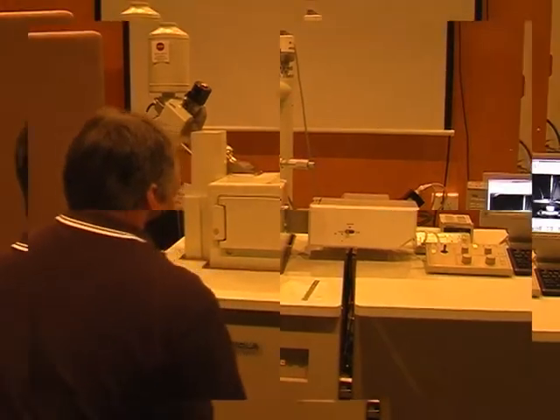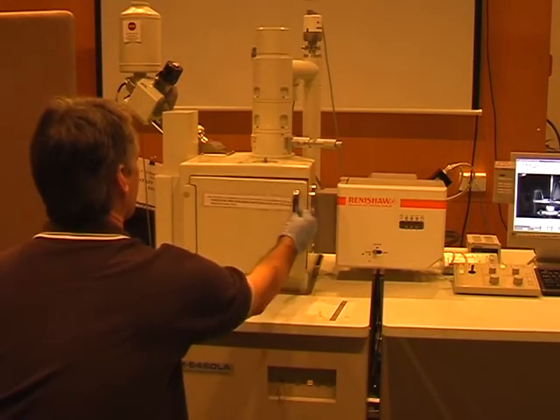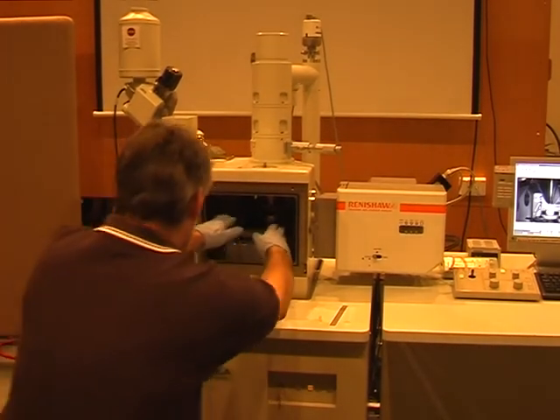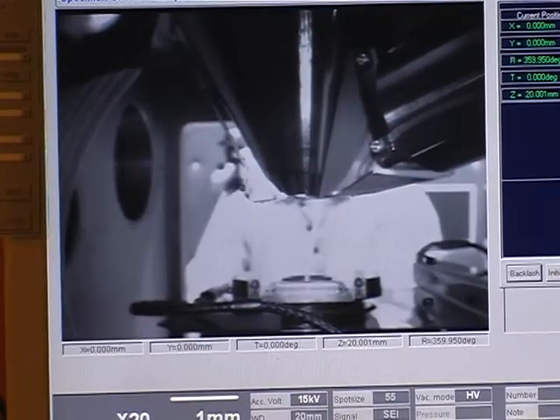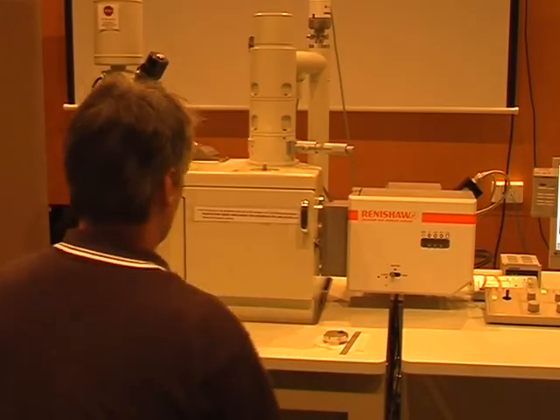Open the chamber door. Remember to apply fresh, clean gloves when handling samples or sample holders. Carefully remove the sample holder and your samples without touching the pole piece or the detectors. Close the chamber door and press the Evacuate button.